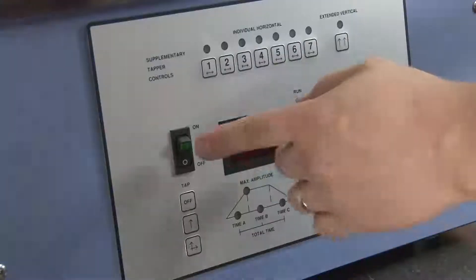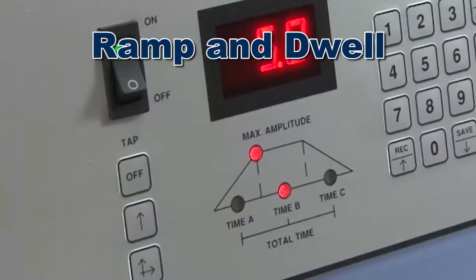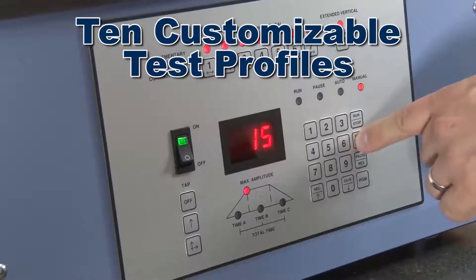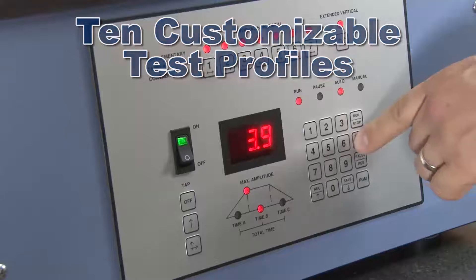The Ultrasiever has an easy-to-use control panel that regulates vibration amplitude, ramp and dwell, test time, and tapping action, as well as 10 fully customizable profiles to assure reproducible test results.